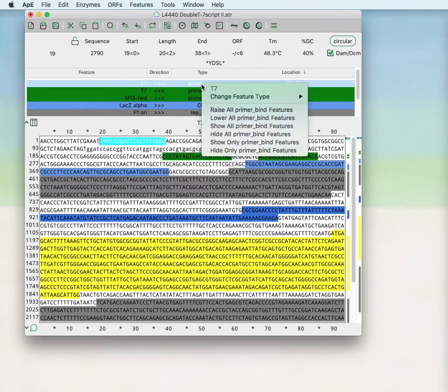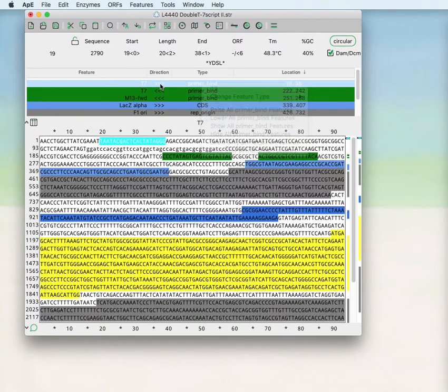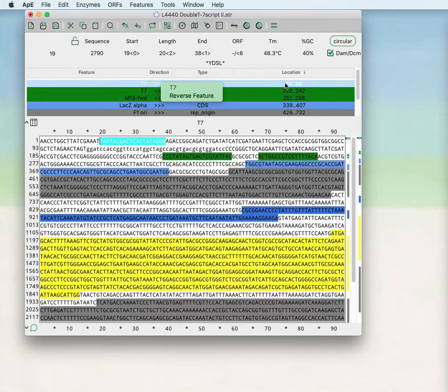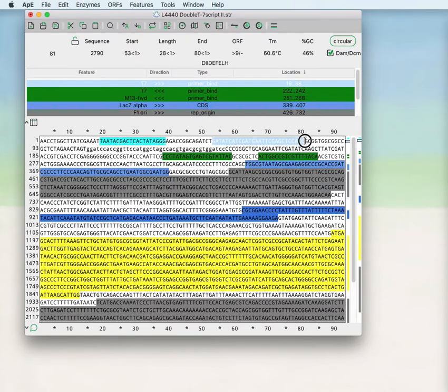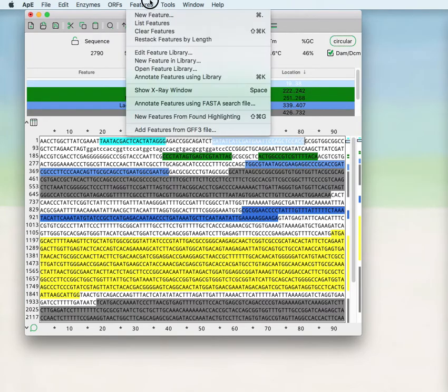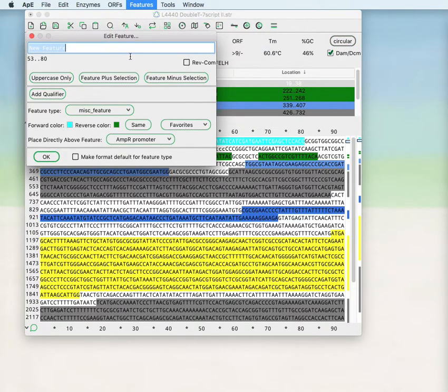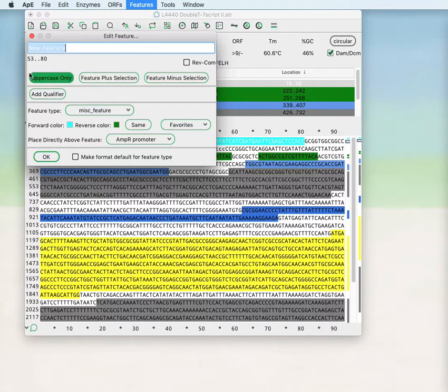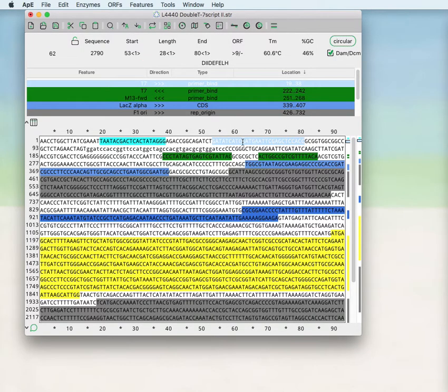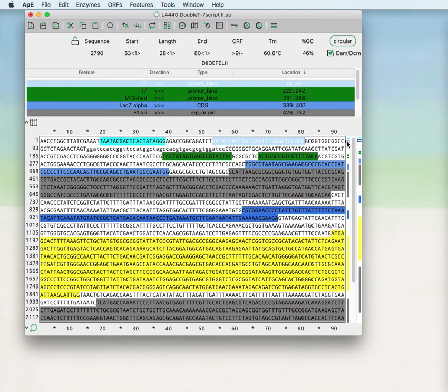You can right-click on any particular data within the table to change that data. You can add new features by doing feature new feature and edit any of the information here or you can edit the information in the table.